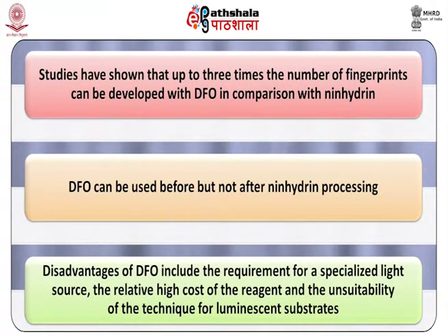Studies have shown that up to three times the number of fingerprints can be developed with DFO in comparison with ninhydrin. DFO can be used before but not after ninhydrin processing. The disadvantages of DFO include the requirement for a specialized light source, the relatively high cost of the reagent, and the unsuitability of the technique for luminescent substrates.